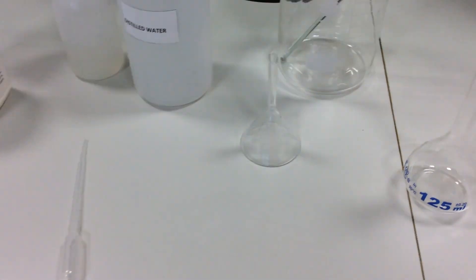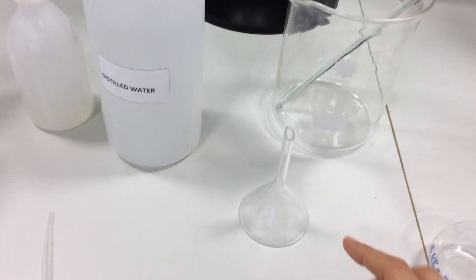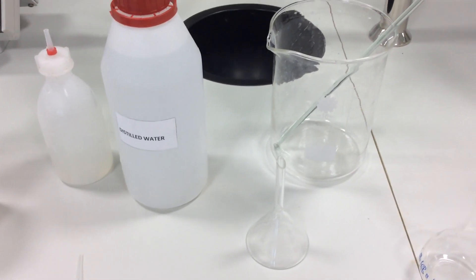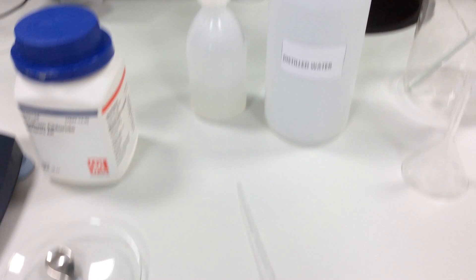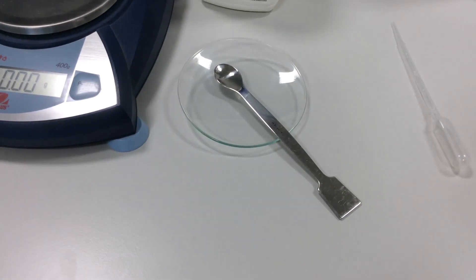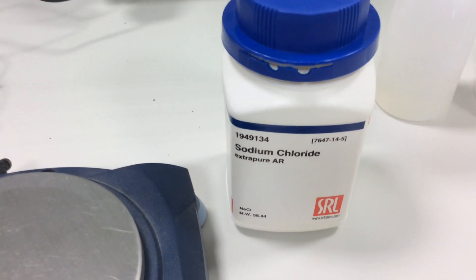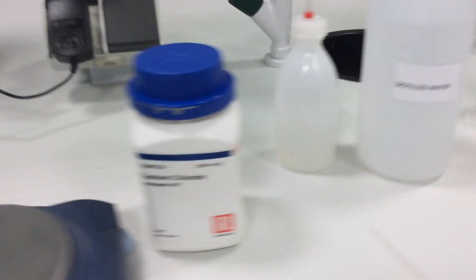I have a funnel I will use to add the 0.73 grams of NaCl. I have distilled water, I have a dropper, I have a spatula, a water glass, the sodium chloride, and a wash bottle.